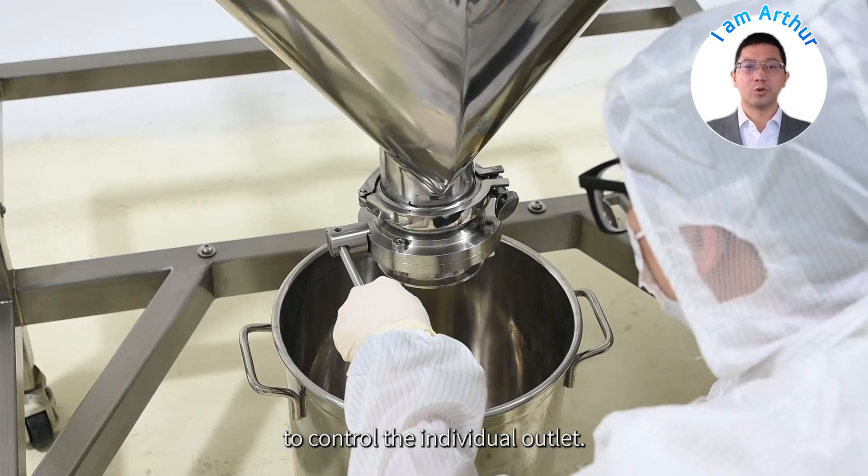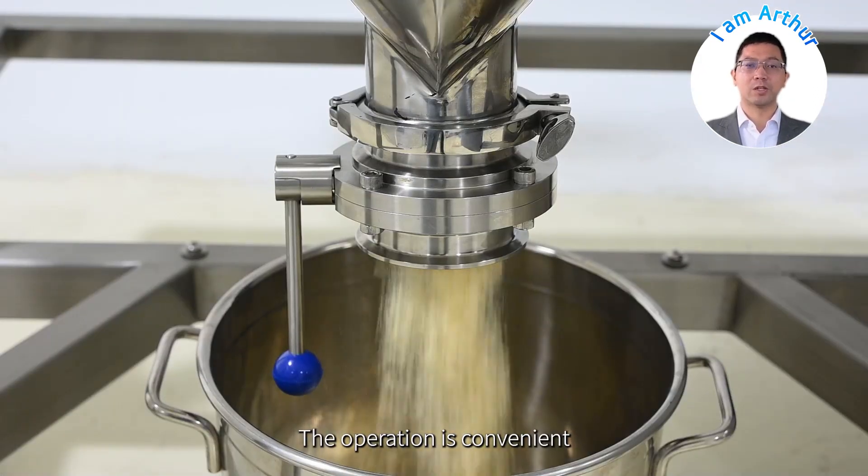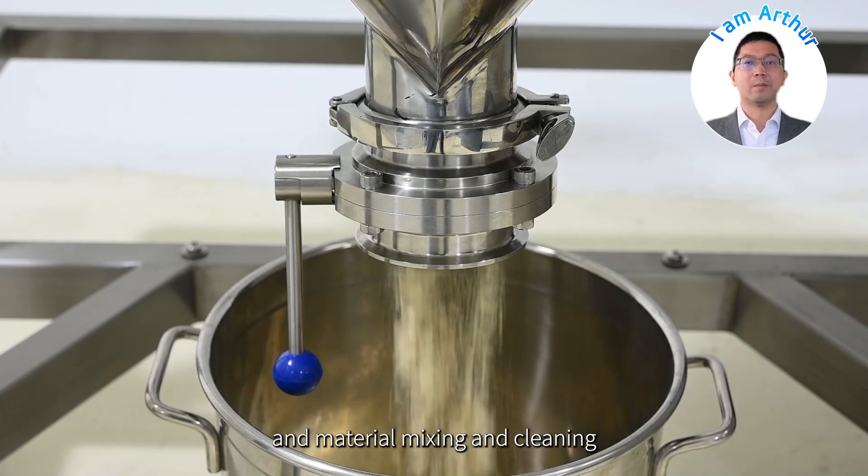With the inching button to control the inlet and outlet, the operation is convenient and material mixing and cleaning becomes simple and fast.